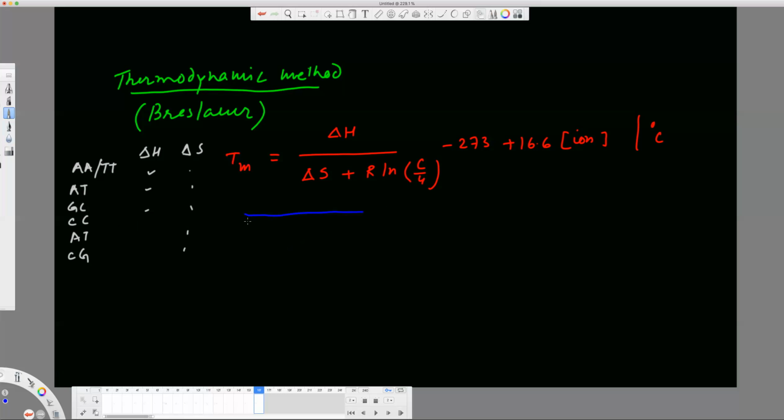What you do, you take the window of 2. You take this primer, let's say this was your primer from here to here. This is the primer sequence. You take the window of 2 base pair sliding windows, right?